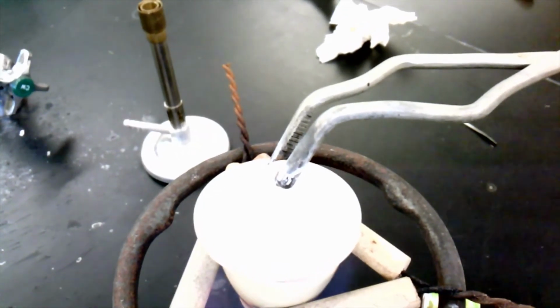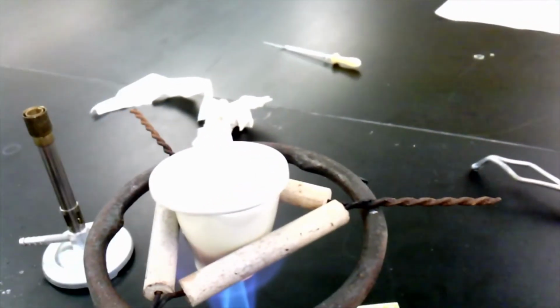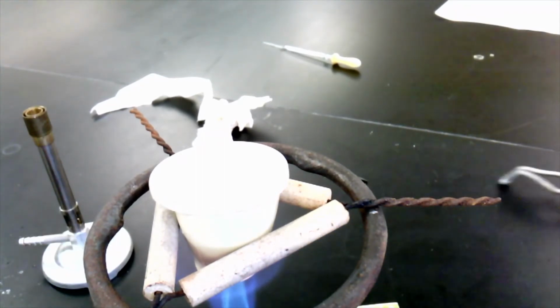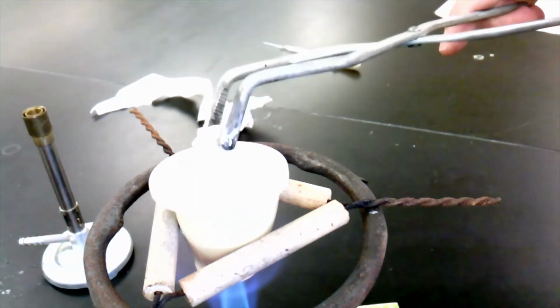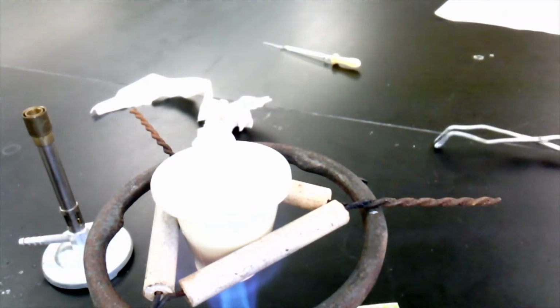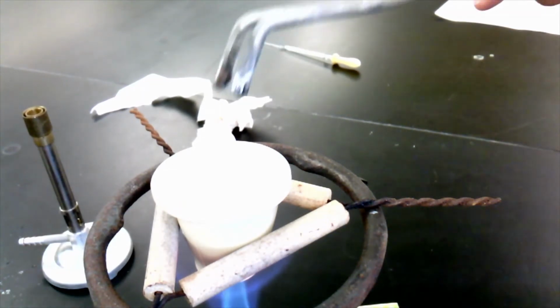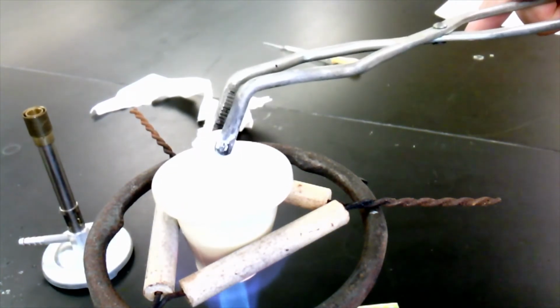Now it's important that we cover it so that we don't lose any little pieces of our product. Because if we lose some of the smoke out of the top of the lid, or if it really starts reacting really well and we lose a bunch of powder out of the top, then our data at the end is going to be no good because we will have lost some of our product. We won't know the mass of our product anymore. So I'm going to heat this for a couple more minutes until it's totally done reacting.